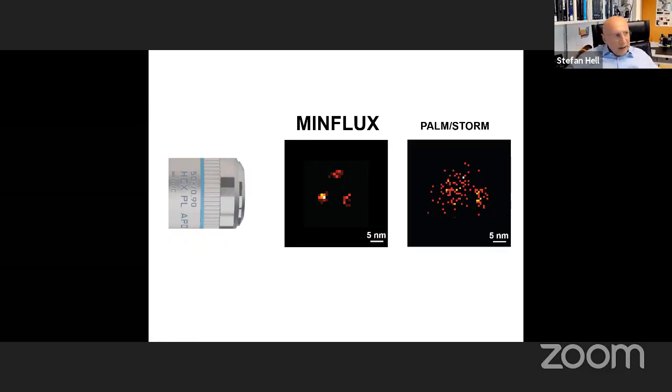And I can tell you, and many of you, of course, will not remember those days, in the early 90s, when I started out saying, oh, in the end, one will be able to see fluorescent objects in fluorescence microscopy at a nanometer scale with regular objective lenses. I mean, this was totally crazy. As a matter of fact, in those days, people believed that you have to squeeze the light through tiny fibers. It was called near field optics, and Eric Betzig actually championed that field. And many, many groups, dozens of groups in the world, went to pulling fibers and to confining the light onto a tiny tip. But this has not worked out, as we all know.